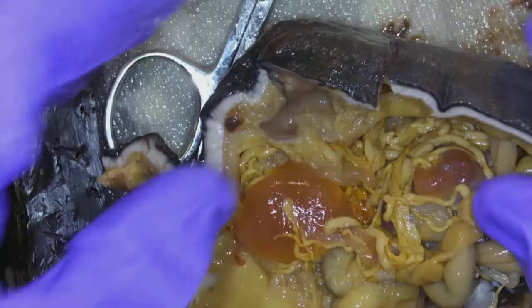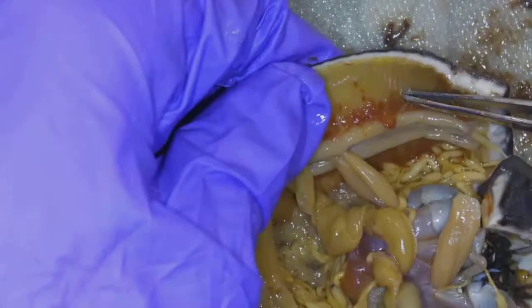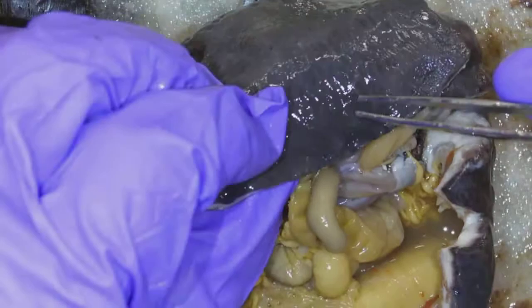Tube feet are hard to see, but these red structures right along here are the inside of the tube feet. The tube feet poke out to the outside. On a dissection video like this you can't easily see where they come out; if I put this under a dissecting microscope and zoomed in, I'd be able to see the holes.